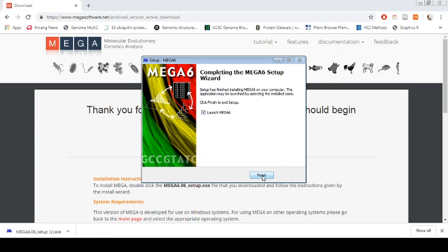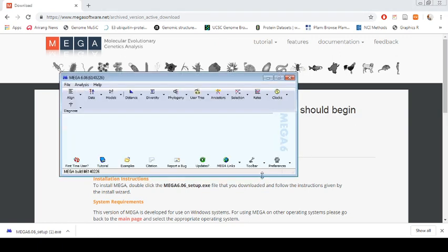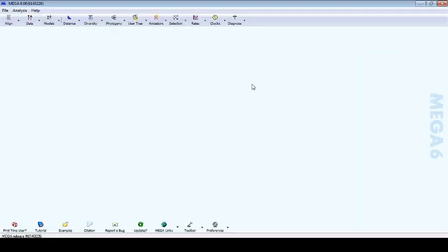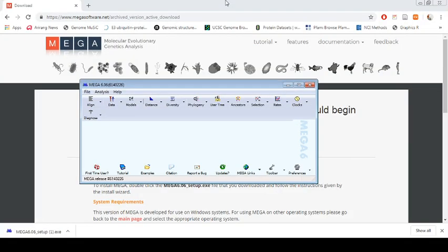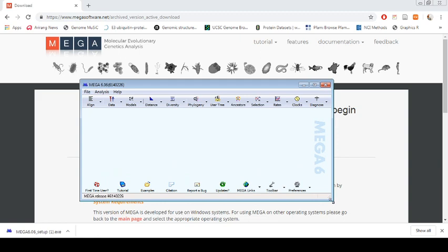It's very easy, very user-friendly, and the best thing about MEGA is that there are a lot of different options you can use for phylogenetic analysis. It's also installed into your computer, so you don't have to use internet all the time for MEGA analysis. That's why it's a very useful evolutionary tree building software.